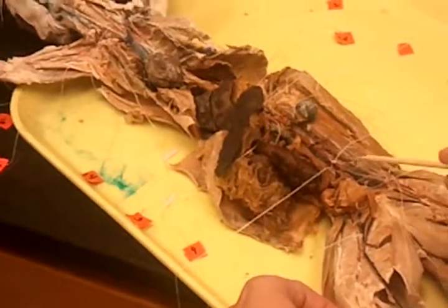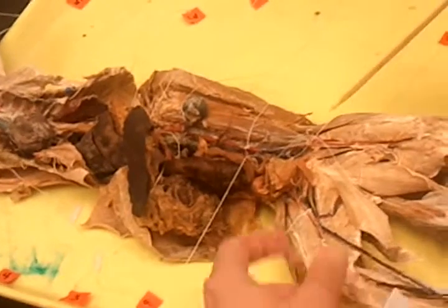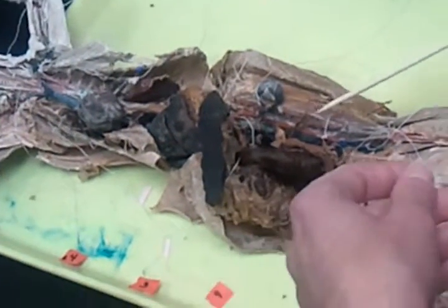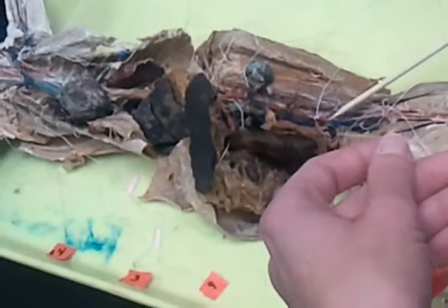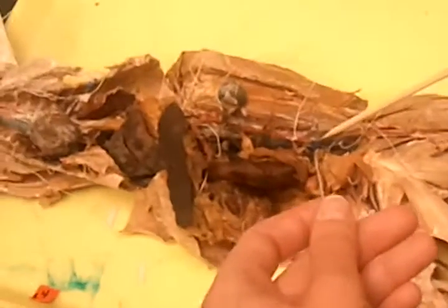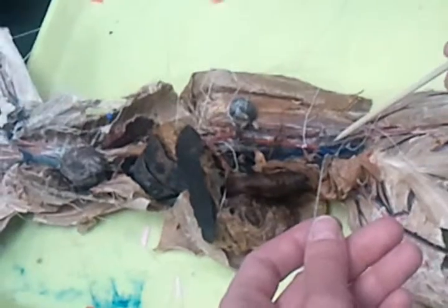Okay, so now we come down here to the pelvic region. So here's the little cat waist. So lower back area, and then the hip bones would be around in here. So coming down the descending abdominal aorta, you guys can see that there's the first split right here. Form these 2 branches. Common iliac artery. This one on the left side, left common iliac artery.